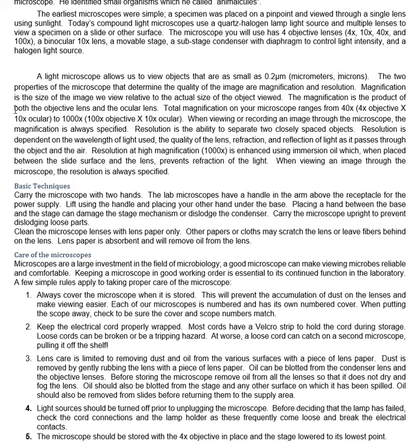We already talked about this. If I want to know how much I'm actually magnifying, I take the eyepiece, the ocular lens, that's the same thing, 10, and then I multiply it by the objective lens. So 10 times 4 is 40, 10 times 10 is 100, 10 times 40 is 400, and then 10 times 100 is 1,000. Okay, let's see what else we got, guys.